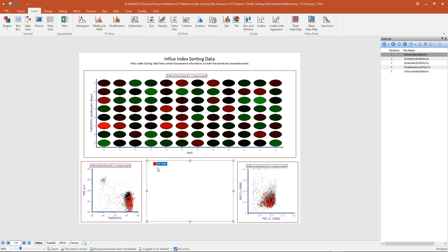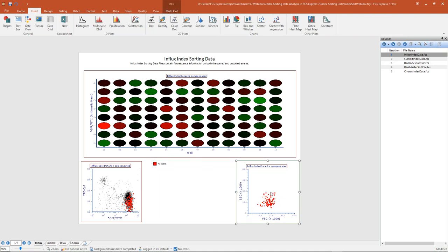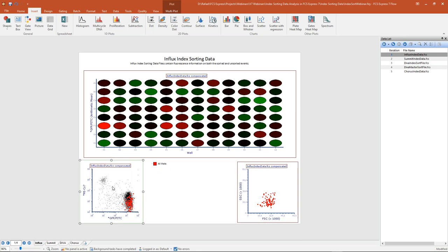Since well gates work the same as any other gate in FCS Express, we can simply drag and drop this gate from our gate view onto my dot plot to the right and apply that gate. Now we're looking at only the index sorted data — the events in my all wells gate. On the plot to the left, we're still looking at all events, both sorted and non-sorted, with the index sorted events emphasized in red.